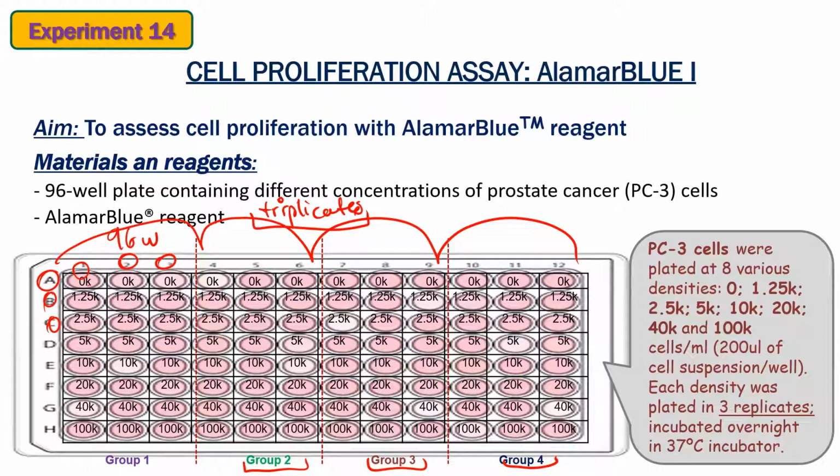Or if you don't have different conditions, you could use all those groups to monitor your outliers, etc. Okay, so the rows here represent different concentrations of cells, or different seeding densities. In this case, we double every time, but in the last we give 100 instead of 80. I don't know why it happened. I will ask Ajan.